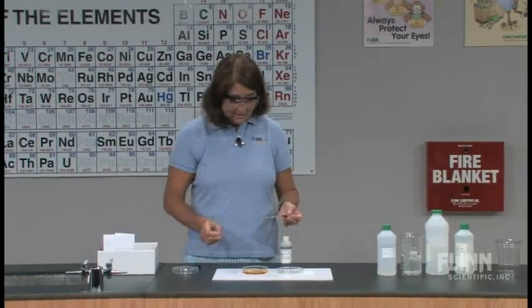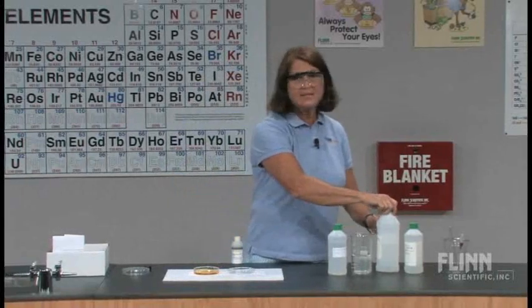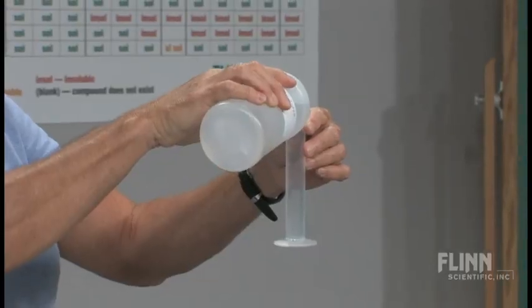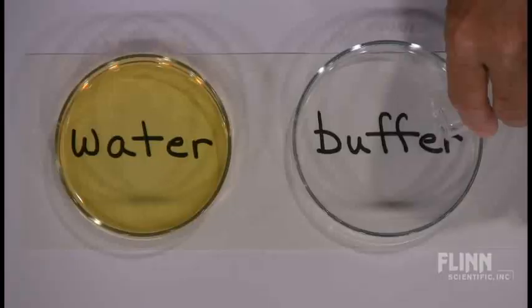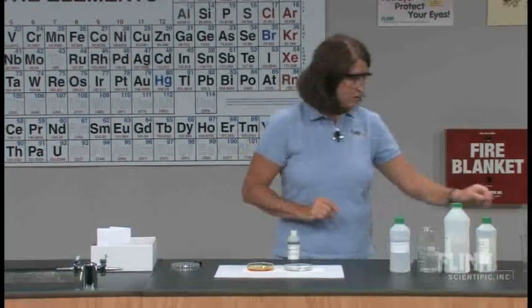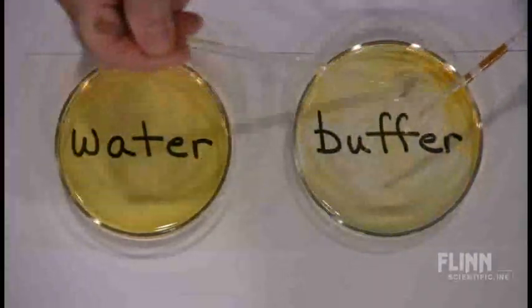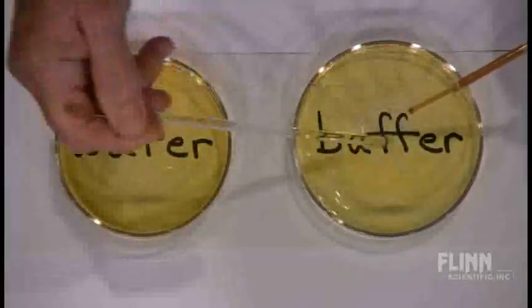I'm going to make my second solution, and the second solution is going to have a buffer. This is an acetic acid, sodium acetate buffer, and it is 0.1 molar with respect to the acid and the salt. Again, the same amount of liquid — 25 milliliters — just enough to cover the bottom of the petri dish. There's our buffer, and I'm going to add the indicator thymol blue again. The color is going to be just a little bit different — still yellow — but slightly different because this is a slightly different pH since it is buffered.